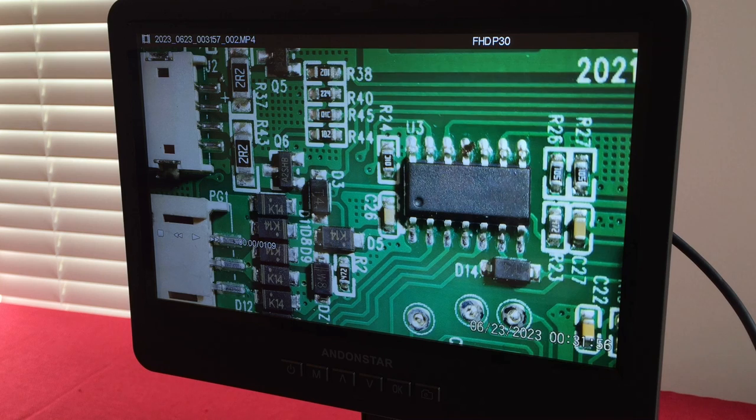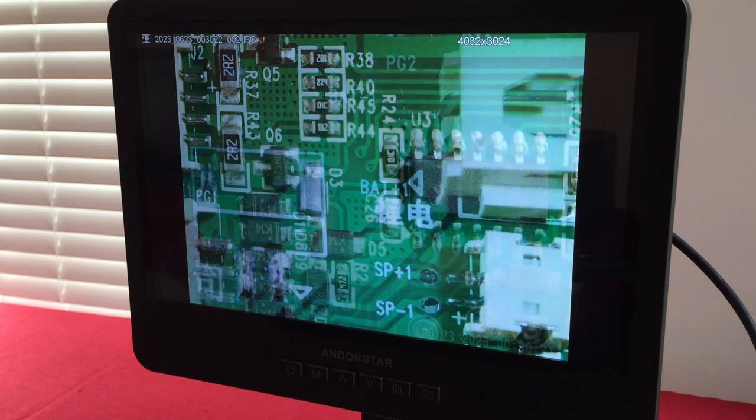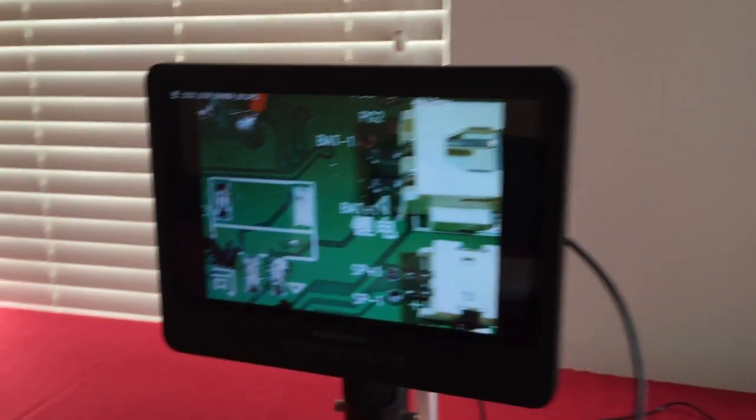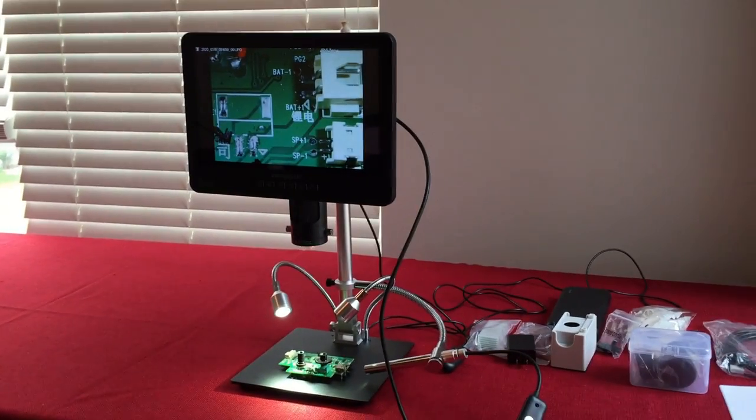Andonstar is an amazing product with a ton of microscopes to fit any budget — from around $50 to $700 for professional models. This unit does quite a bit. Going back to review pictures, there's the first picture ever taken with it. Bringing the camera back to show the full size of the device — it's the Andonstar AD249S.